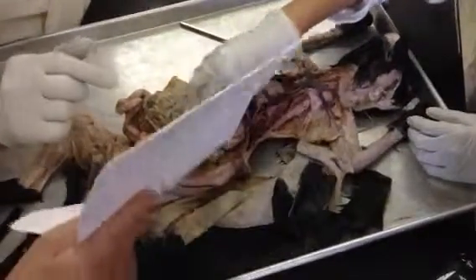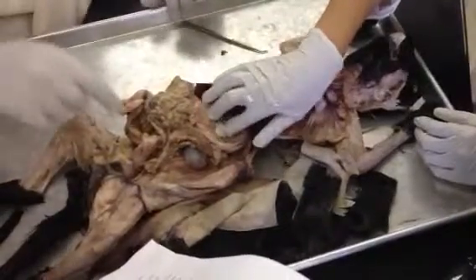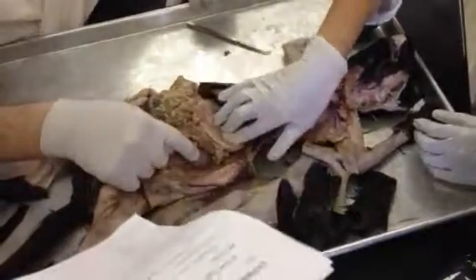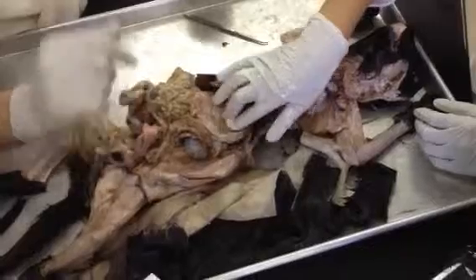Show me the stomach. That's stomach. Cheng Su, what was your question? You had a question? This thing there, that's a kidney. We haven't done those yet. We haven't done the kidneys yet. We'll get to that though.